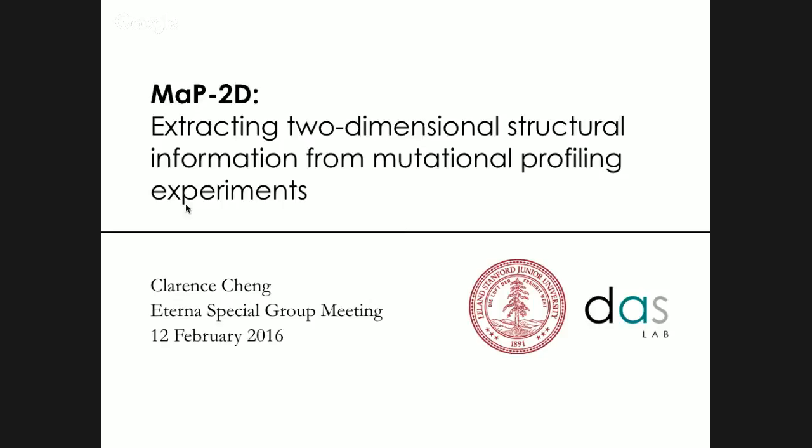Today, I'd like to tell you all about a project that I've been working on to derive two-dimensional information on RNA structure from a type of chemical mapping experiment called mutational profiling.